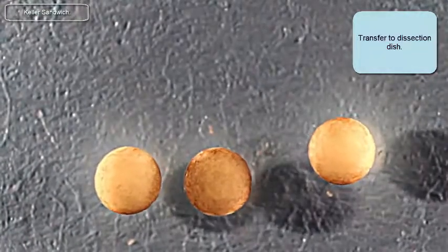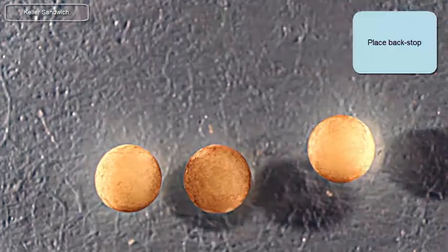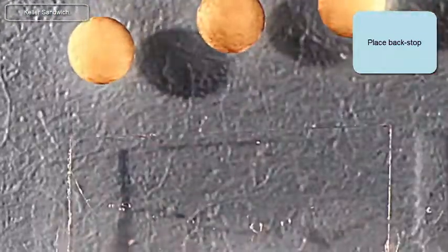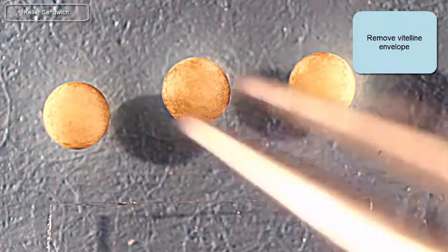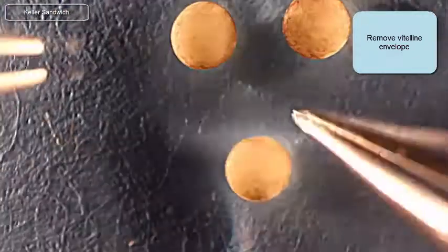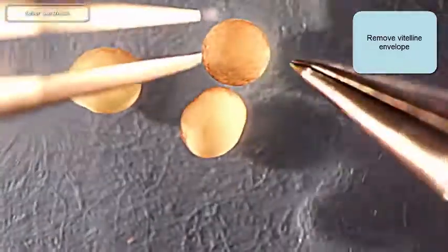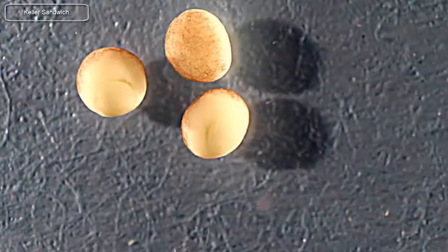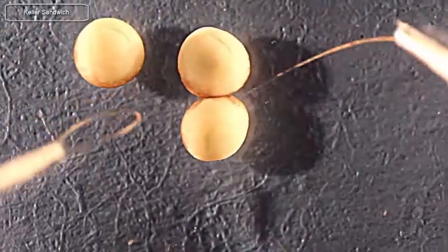Transfer those embryos to a dissection dish. Place a backstop that's going to help you manipulate embryos and explants later, kind of giving you a third hand. Here I'm going to remove the vitelline membrane with a blunt forcep in the left hand and a sharp pointy forcep in the right. Try not to damage the surface of the embryo, but if you have to, don't mark it up in the marginal zone itself — just poke a hole in the animal cap.